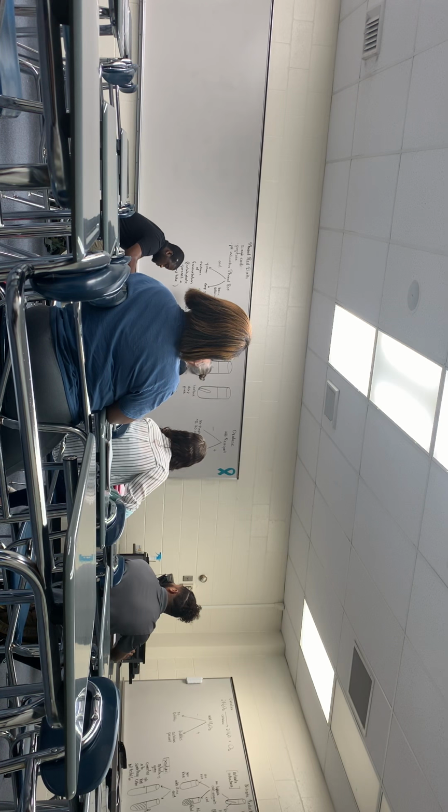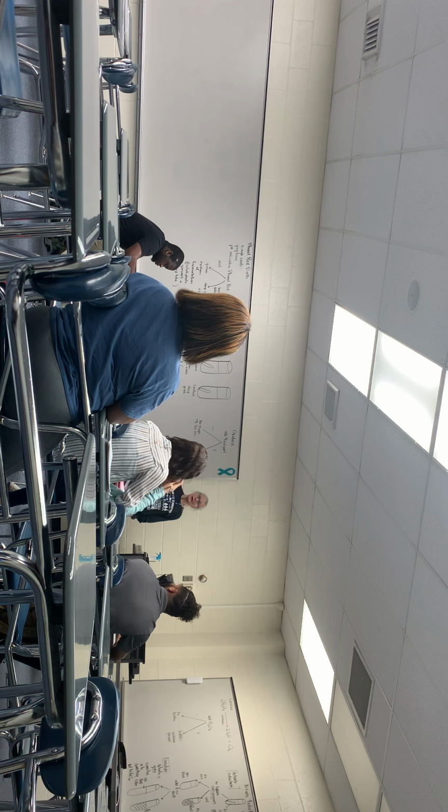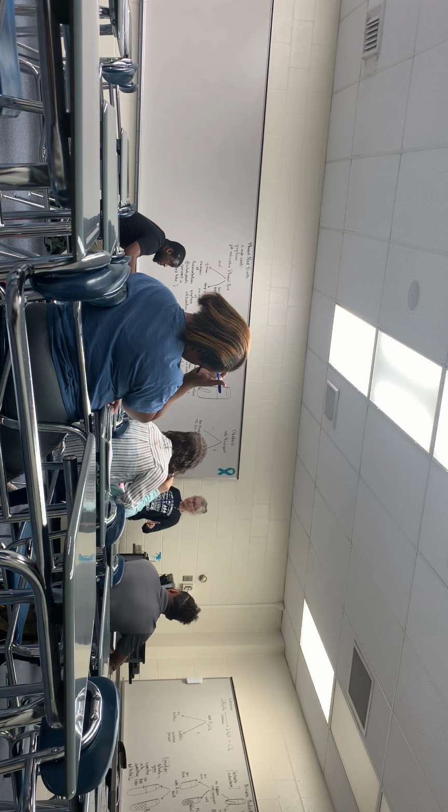The other thing that can happen is if it's using the peptone, the medium will become basic. That causes the phenol red to turn a deep pink color. So when you see that deep pink, you know that's evidence of peptone utilization, not fermentation. Okay, so those are the two options. Either using the peptone or fermenting whatever sugar is in that test tube.